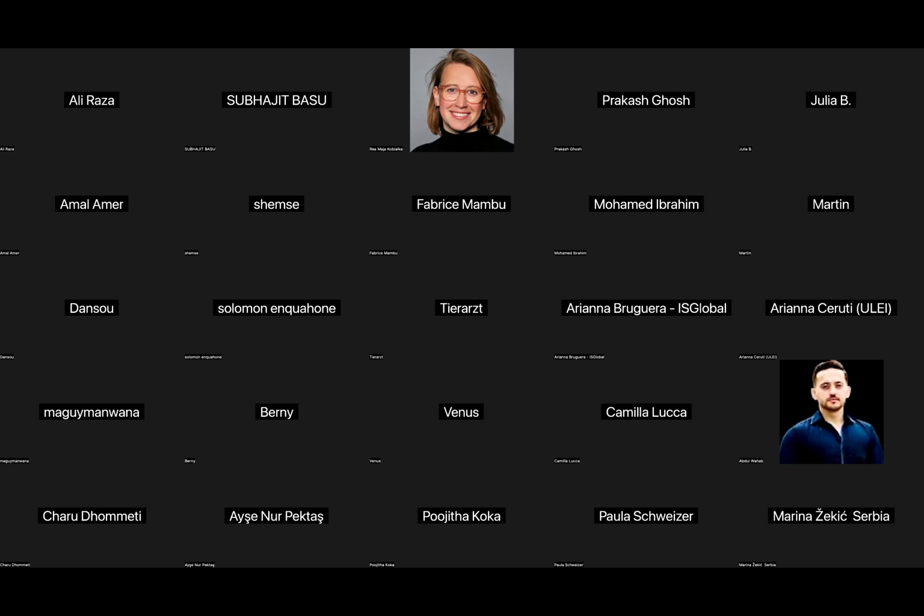But for assembly corrections, there are different software tools. Nanopore has Medaka, and there are other software that you can use to get more accurate alignment and more accurate assembly. Okay, thank you so much.